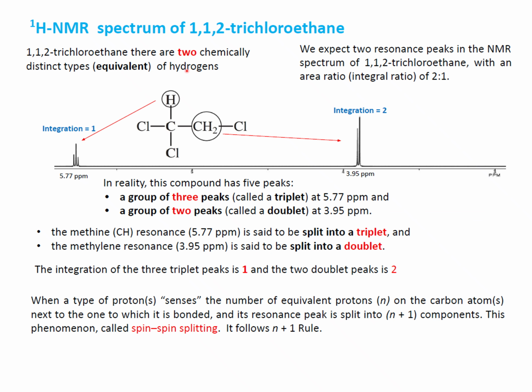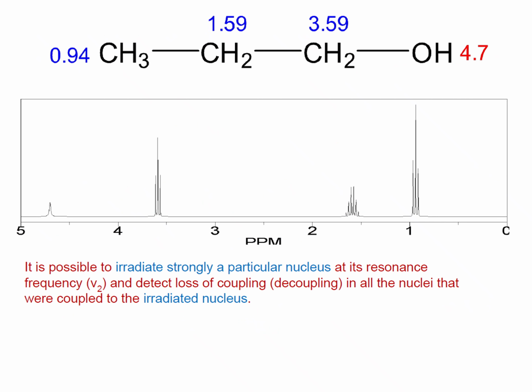Here the NMR spectra of different chemicals have been shown. I think you can now easily identify the spectrum, as I have also discussed this in the previous lecture. Here I will show you some practice problems. Just practice this yourself for the betterment of your examination.